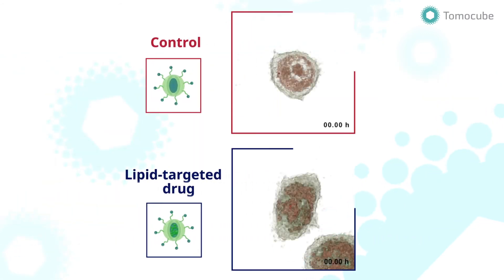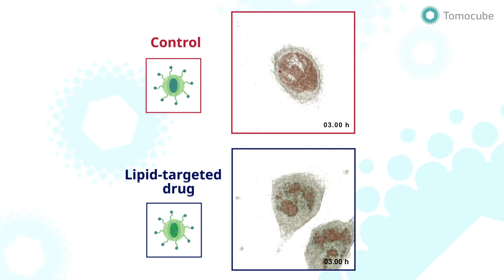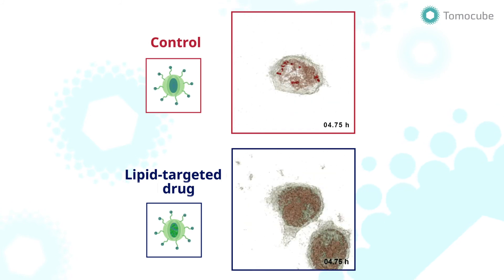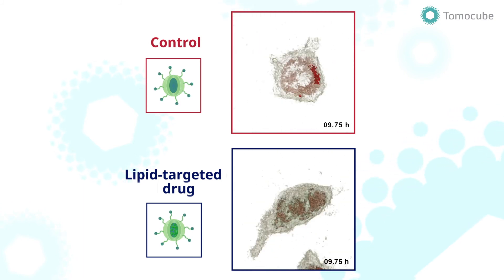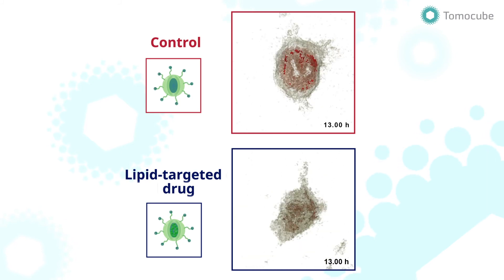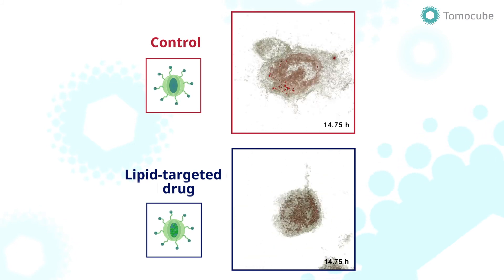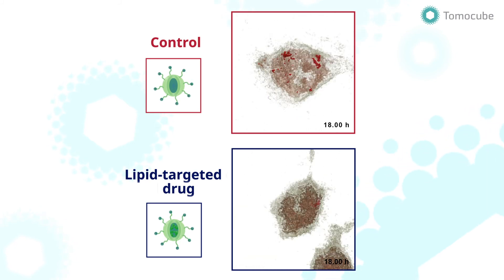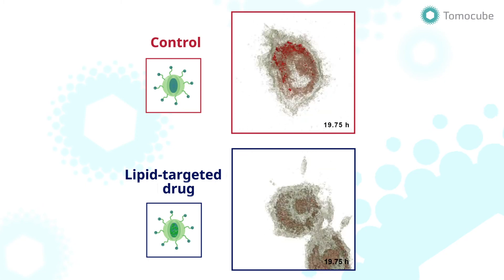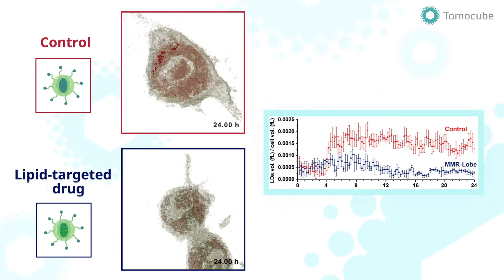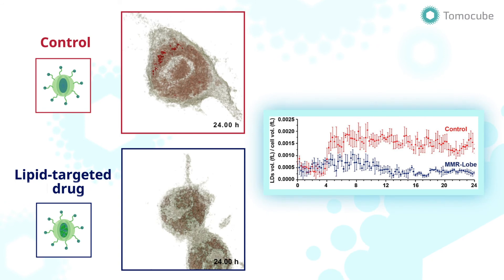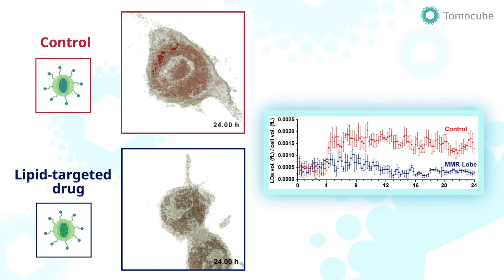Finally, the team identified changes to the macrophages after treatment with macrophage-specific lipid targeting drugs. The foam cell formation process after drug treatment was recorded for 24 hours by HT time-lapse imaging. The quantitative analysis of lipid droplets in the cells showed that the drug-treated macrophages did not form lipid droplets compared to the control group.